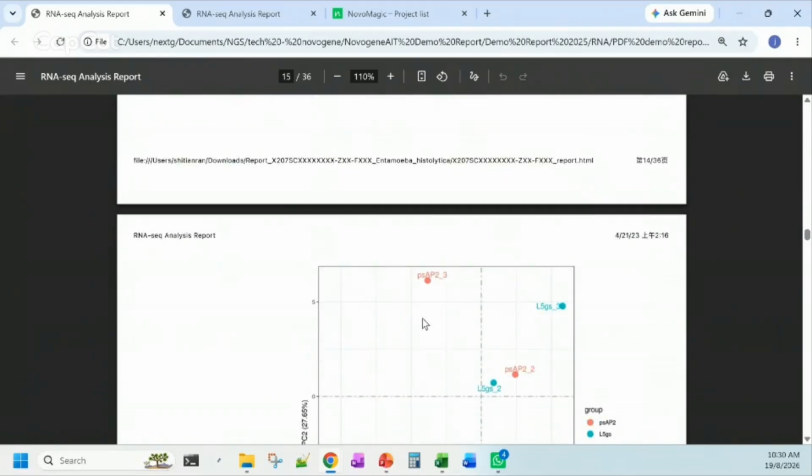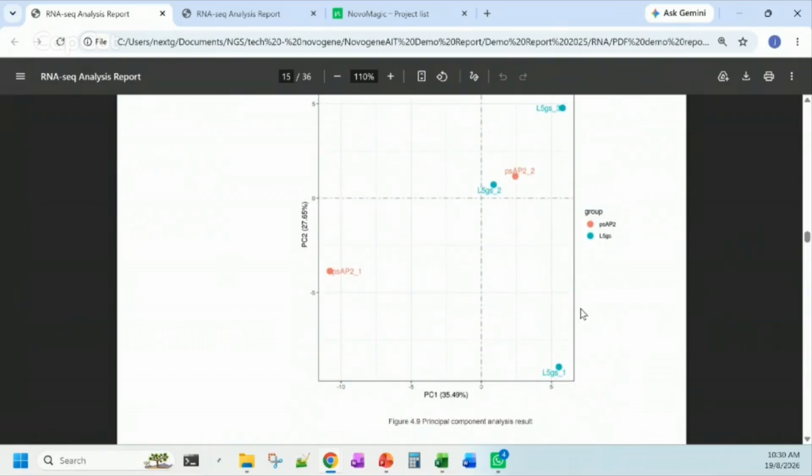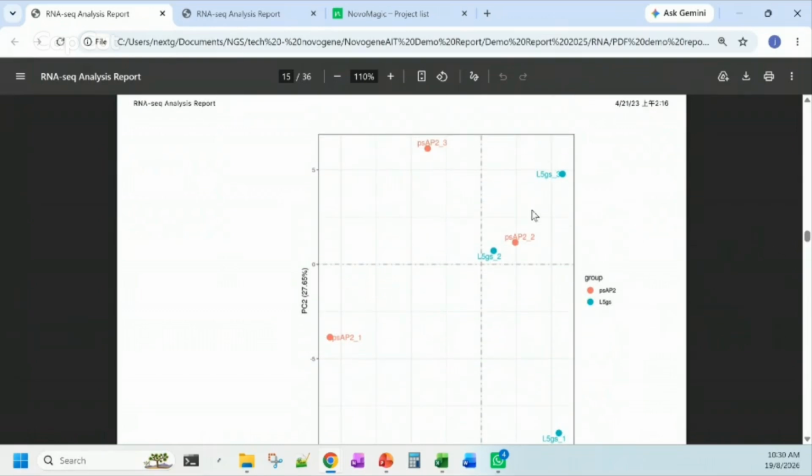Another way to look into the comparison or correlation is the PCA plot. This is even more straightforward in telling us which sample is closer to which samples. Sometimes the experiment might involve conditions that are not so different in terms of expression profiles. One of the projects that I was involved in before was trying to see whether there is any gene expression profile change with certain supplements.